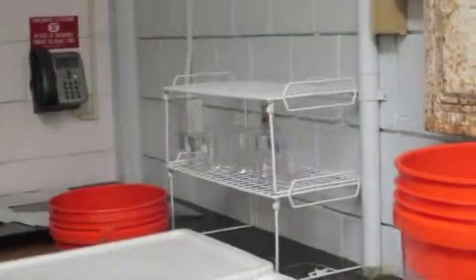we have some glassware soaking in acid. This is 10% hydrochloric, and 10%. And then here we have 0%. And this bath is just deionized water to rinse the acid off. And once we soak it in DI, we put it on a drying bench and wait for it to dry so we could use it.